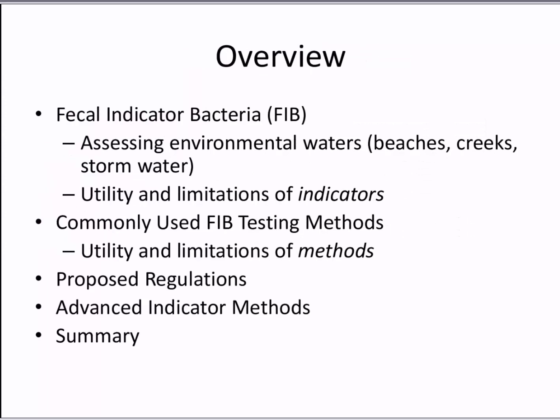I'll be discussing the use and limitations of fecal indicator bacteria to assess environmental waters, and speaking mostly about their use for monitoring beaches, stormwater, creeks, and briefly discuss the use and limitations of the test methods and proposed regulations.